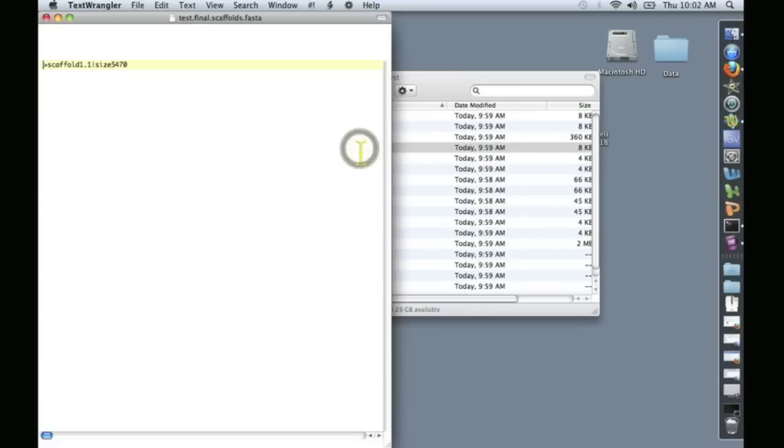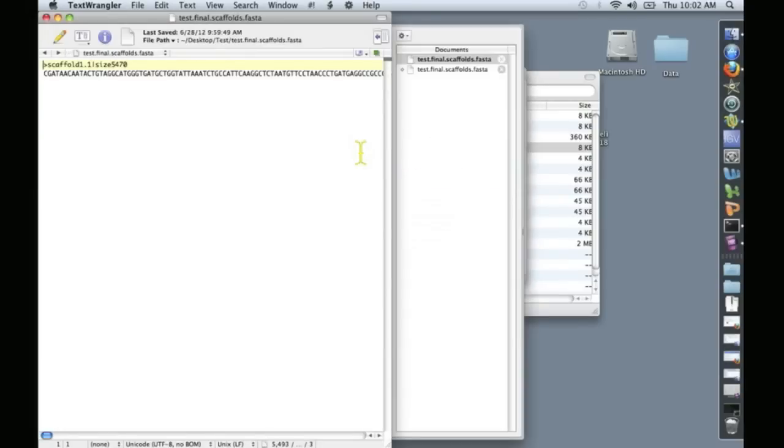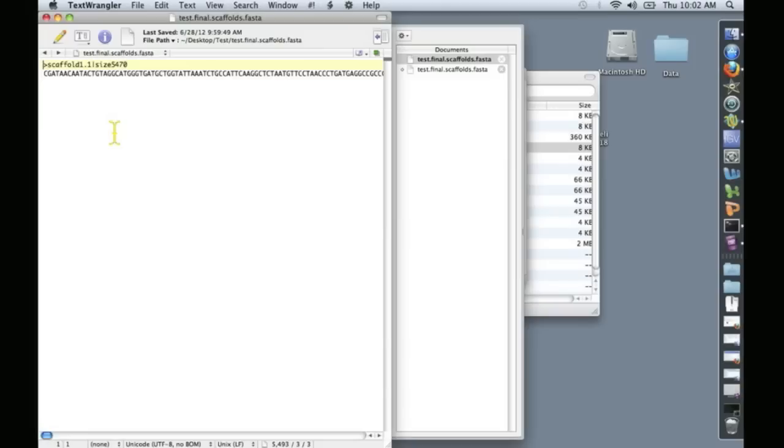Let's open it up and here we go. This says that we have one scaffold of size 5470. There's a sequence right there, congratulations you've assembled the PhiX bacteriophage genome.